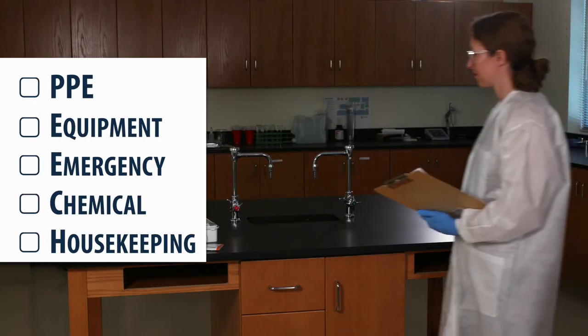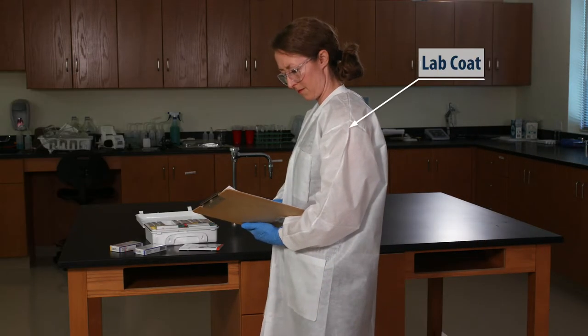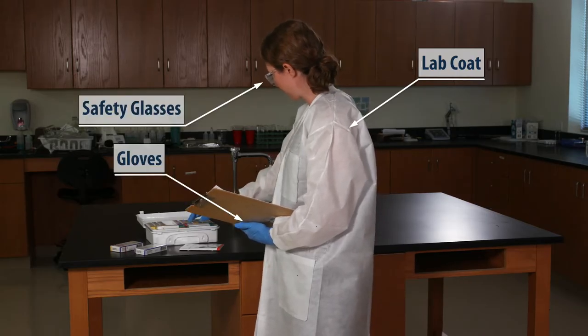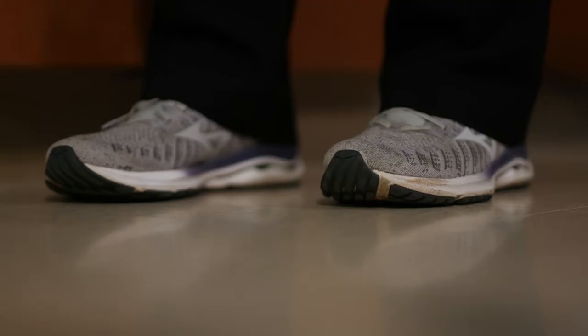Let's start with PPE. Lisa is wearing a lab coat, safety glasses, and gloves, which is always required for general lab work. She's also dressed appropriately: closed-toed shoes, no jewelry, and her hair is tied back.